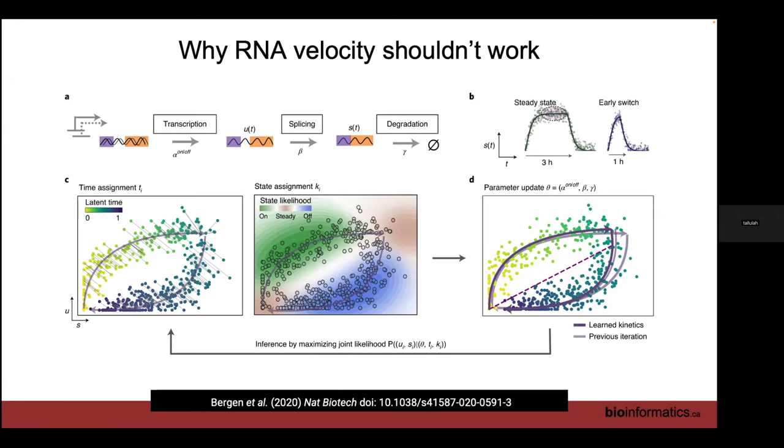You can also get reads that look like they're coming from introns from other things, right? You could have a long noncoding RNA or an antisense gene that's located in an intron that will give you intronic reads that actually aren't intronic reads. Right? They're not coming from an unspliced transcript. They're coming from a different transcript that's located in that intron.